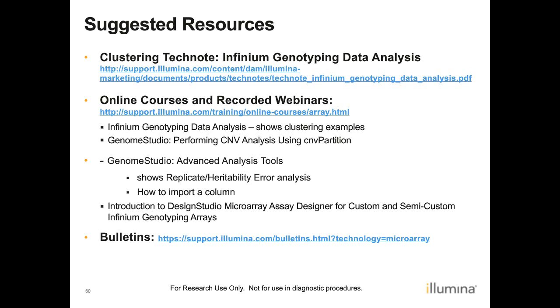There are also a large number of online courses and recorded webinars available in the online courses and recorded webinars link that I have listed here. Some particular items of interest: the Infinium Genotyping Data Analysis training shows examples of clustering. GenomeStudio performing CNV analysis using CNV partition is also a training video that goes through how you would do CNV analysis using GenomeStudio.